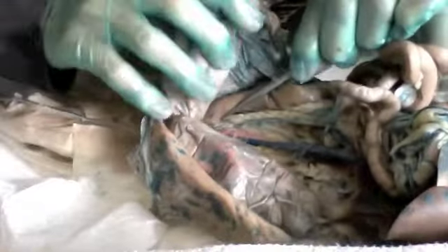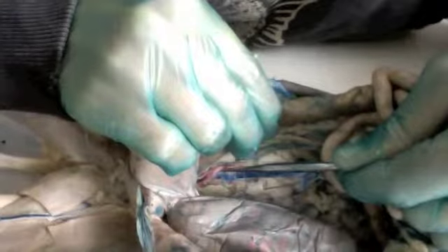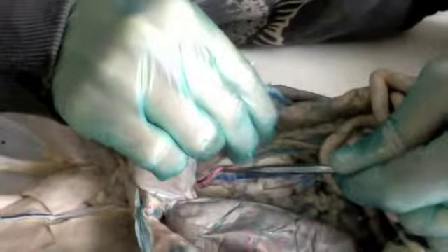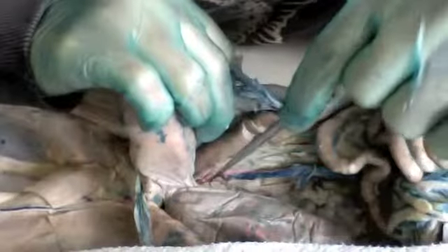You can see it split. Splits off right there. You can see the two right there. Those are the external iliac arteries, left and right side.